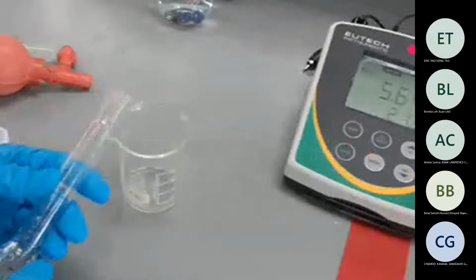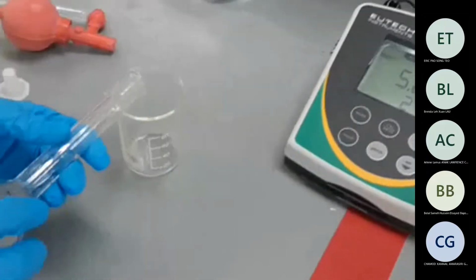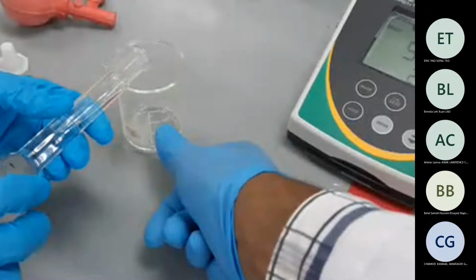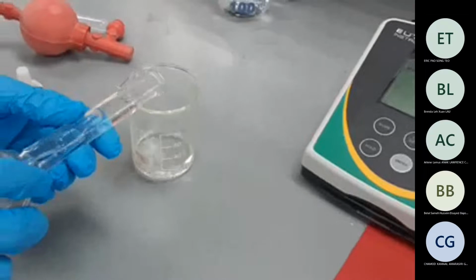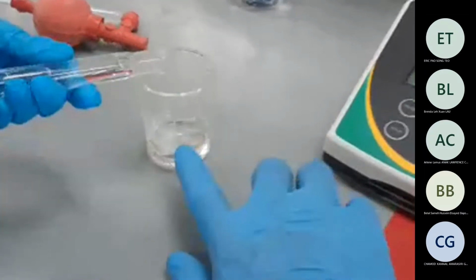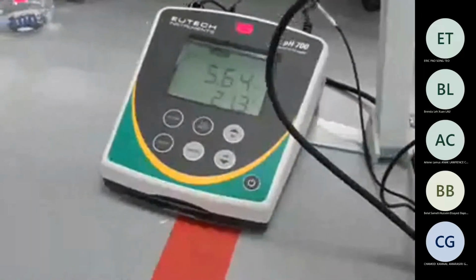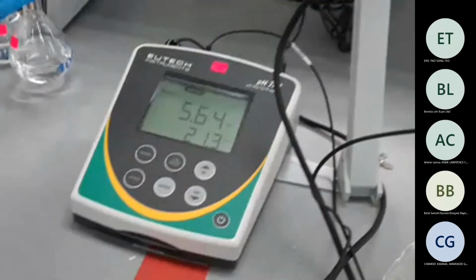Then take around 60 milliliters, up to 60 here, so that our probe will be dipped inside. This is the thing we're going to do.